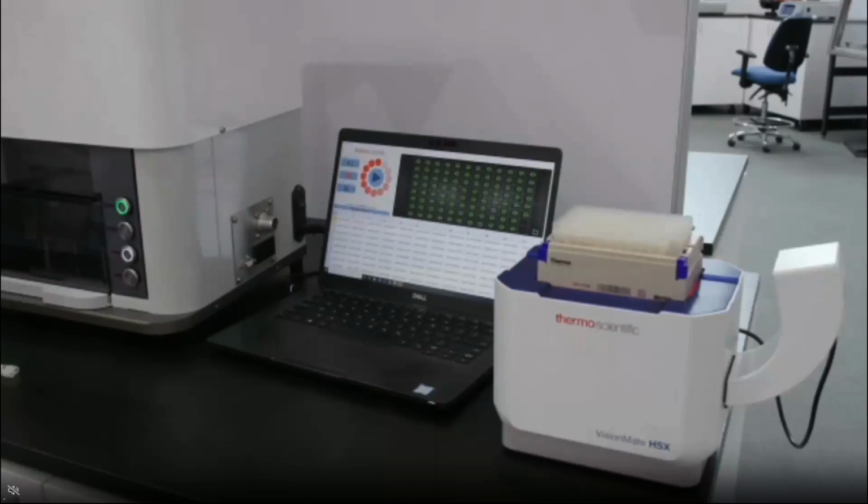This really helps in understanding how the samples are being utilized in the lab, where they are, and what is left behind, so you can keep a complete record of entire racks of samples at all times with a little bit of automation, as I mentioned. So with that, let's cut back to the immersive lab camera.